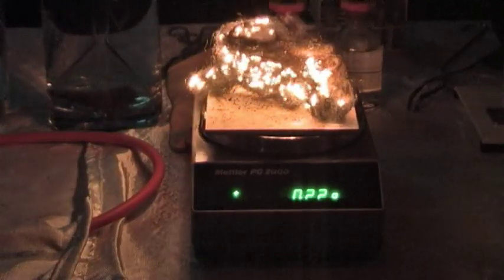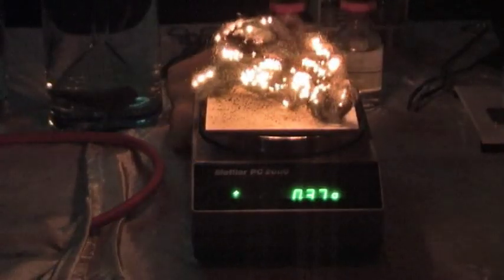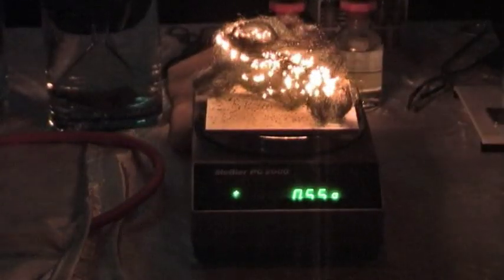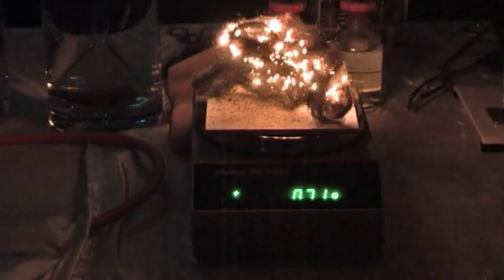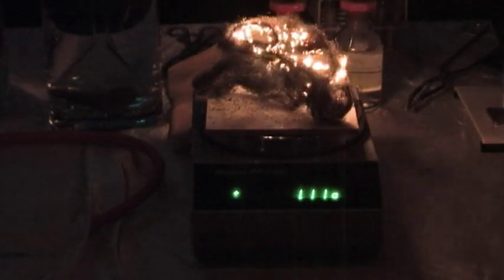The iron wool is combining with the oxygen from the air, and a chemical reaction is taking place that's giving out heat and light. And the reading here is increasing. It's getting heavier. So the iron is combining with the oxygen from the air, forming iron oxides, and it's trapping the oxygen from the air in this new chemical compound. So now this is a gram heavier than it started off. This is because of the oxygen chemically combined with the iron. It's 1.2 grams heavier, still increasing as it's continuing to burn.